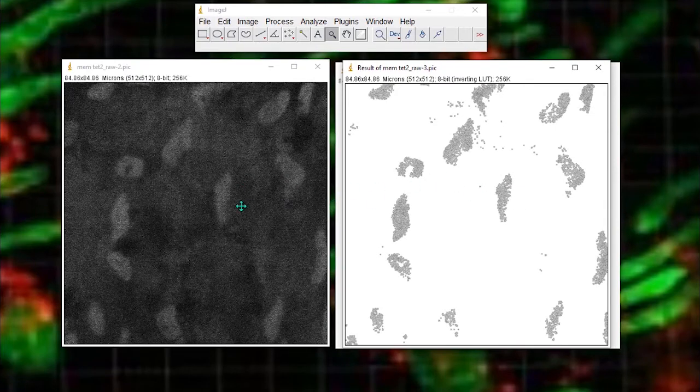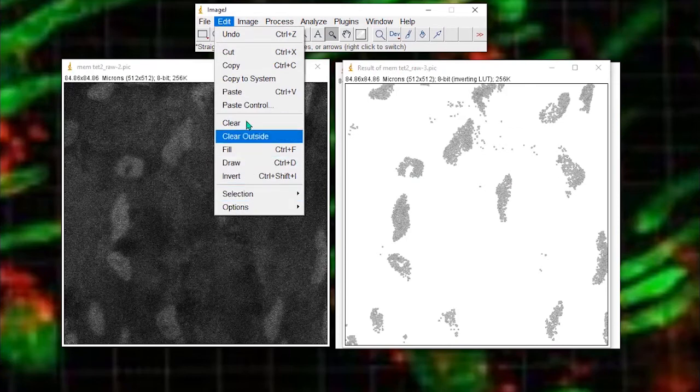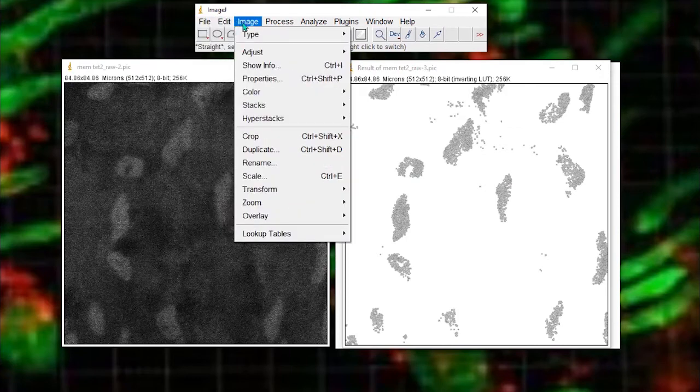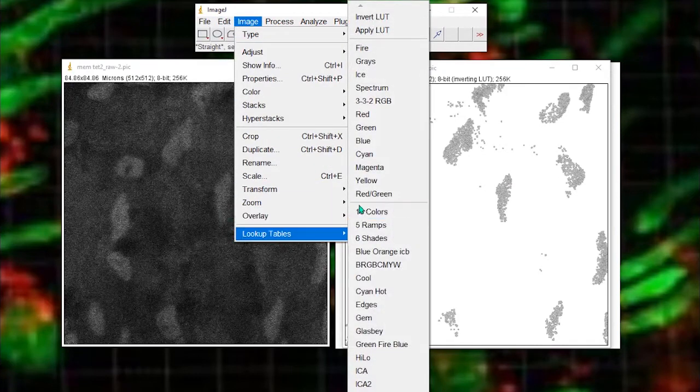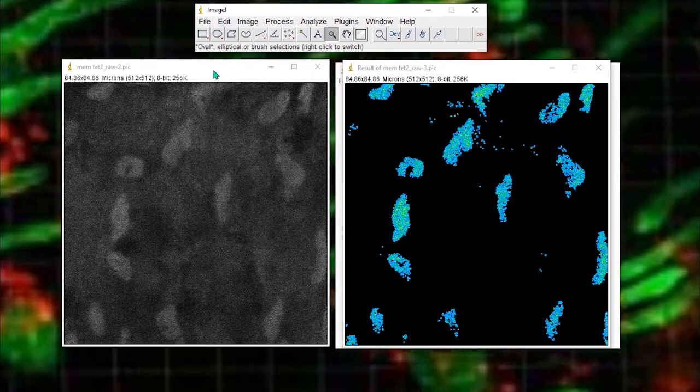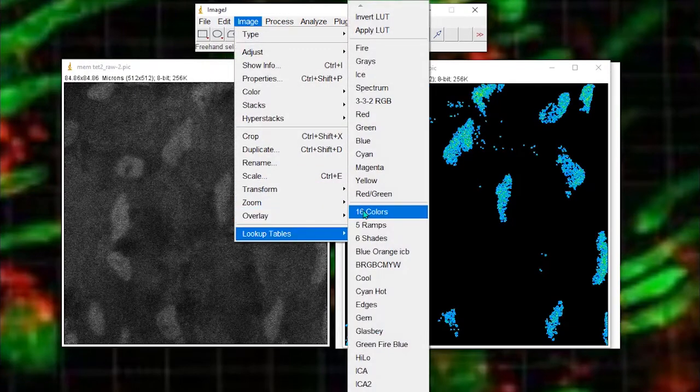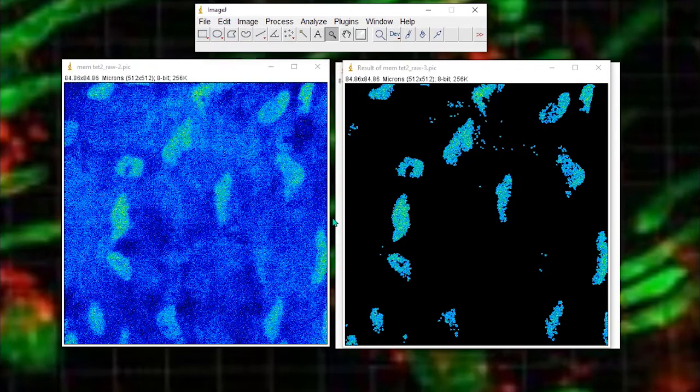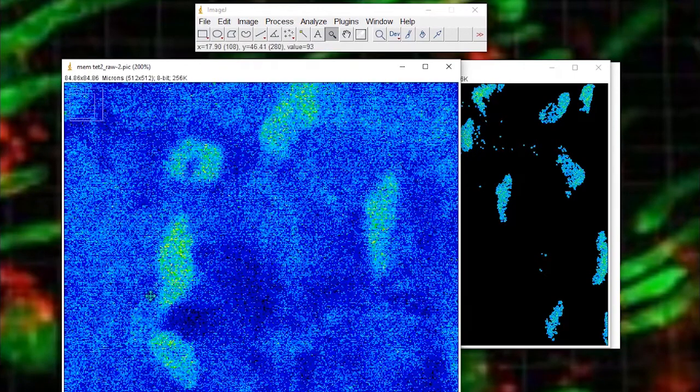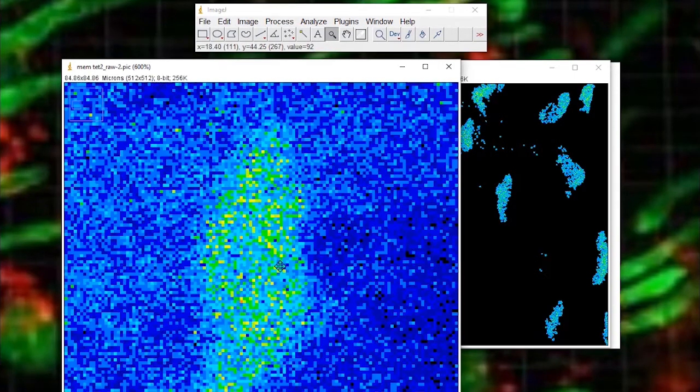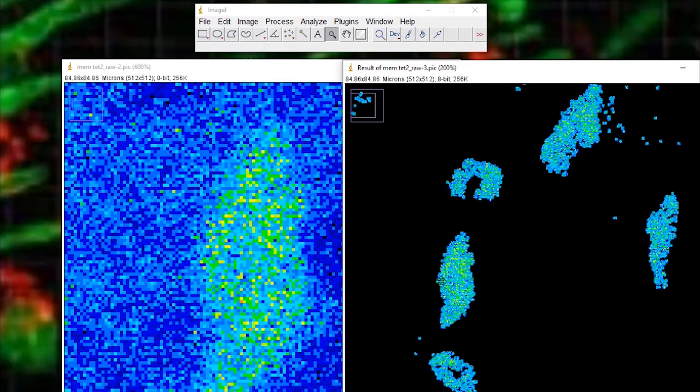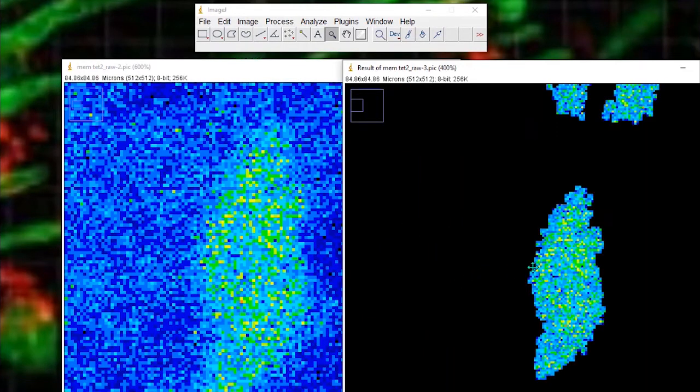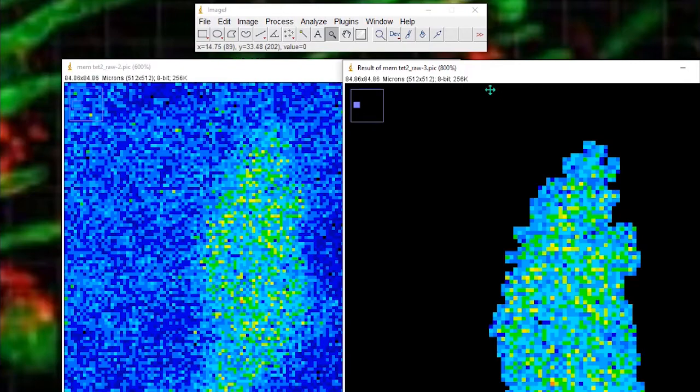We want to make sure that the intensity values haven't changed. So let's just quickly change the lookup table. Let's use a 16 color ramp. Here we'll use a 16 color ramp. Let's zoom in on, yeah, maybe this one here. And get the same thing here. If the values haven't changed, we should be seeing exactly the same pattern of pixels.